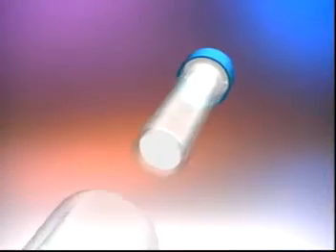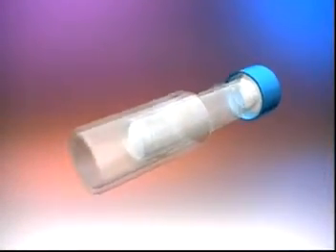Wattman Mini-Uniprep, the fastest and most convenient method for HPLC sample preparation.